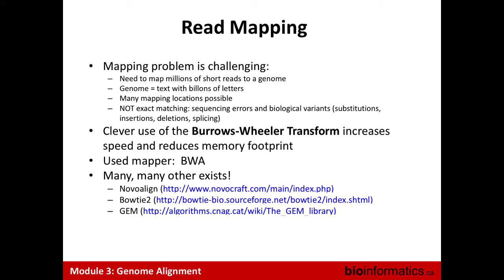What is complicated, what is challenging in terms of the process, is that many locations could be possible for one read, with the same probabilities. So sometimes you won't be able to know what is the exact location of your read.